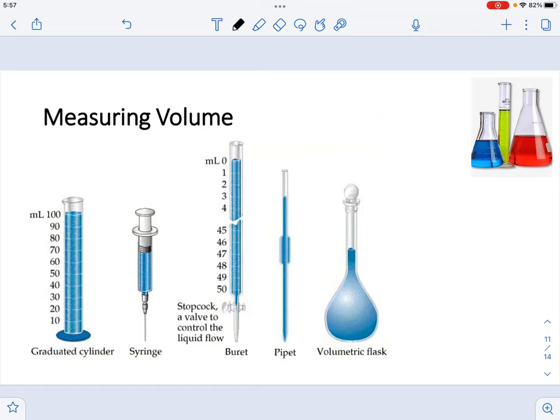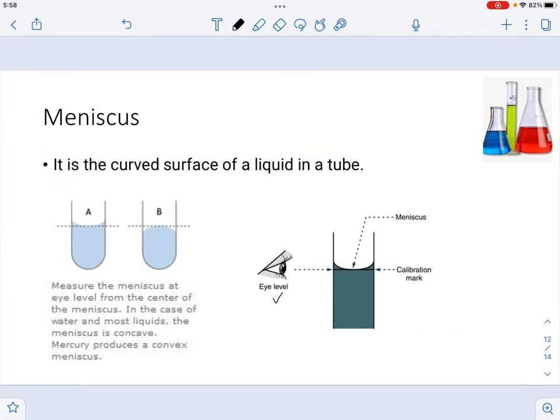Another measurement you need to know is volume. In the laboratory, we can measure volume using a graduated cylinder, syringes, burettes, pipettes, and a volumetric flask. The volumetric flask is the best glassware for measuring volume, but commonly we use the graduated cylinder, burettes, and pipette. When measuring volume with those three, we pay attention to the gradation on the glassware and read it based on the curvature that the liquid forms — which leads us to talk about the meniscus.